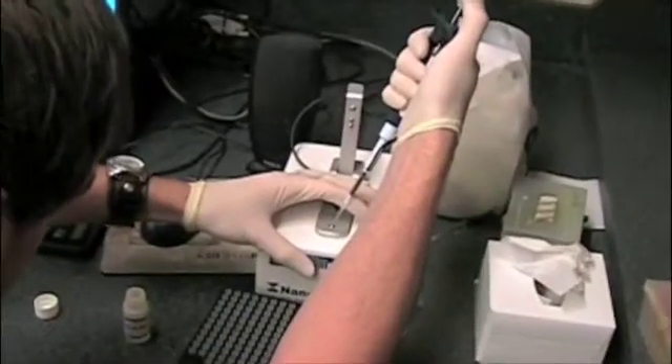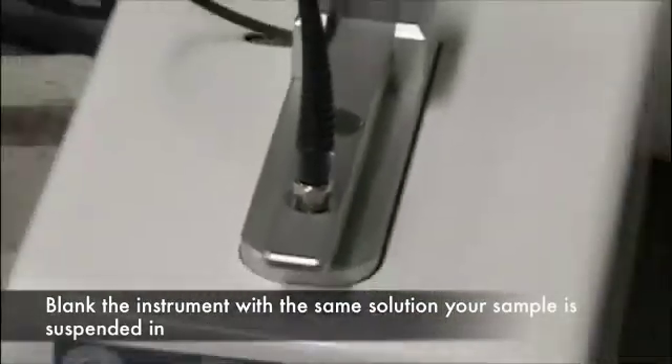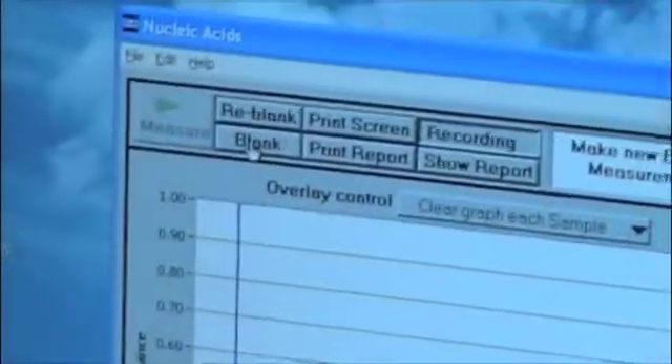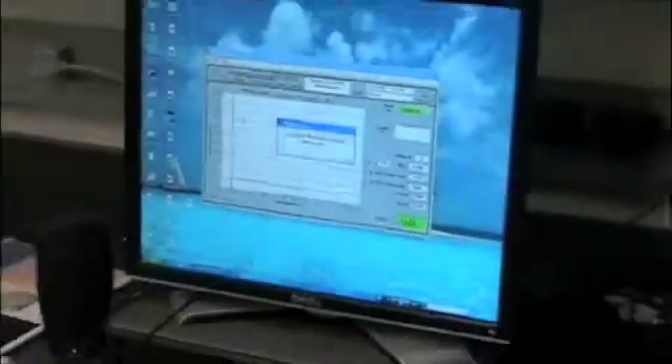This is actually the blank. We're adding the water on again and lowering the arm, then clicking on blank. So now we're getting a blank — making a blank measurement. The machine will make two clicks.